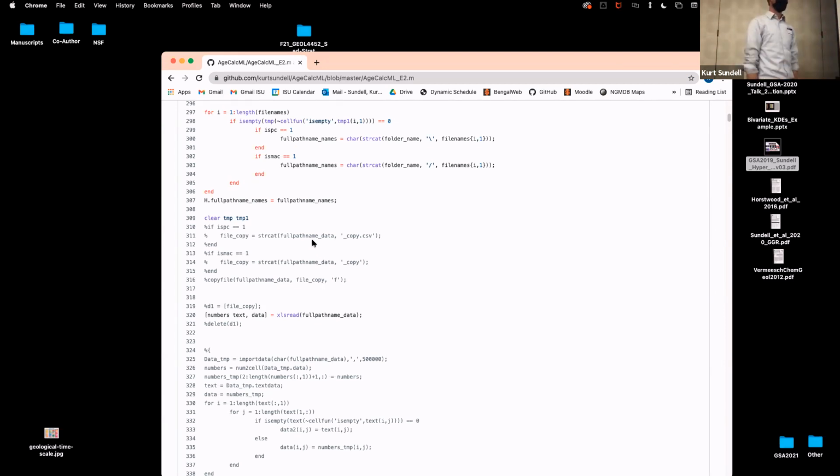We were chatting during the break, talking about robustness of ages. There's a lot of knobs you can turn, and Sarah went over some of the details. It's really kind of hard to tinker with the age too much, I've found. I've played a lot with data reduction and written a lot of code. Honestly, uranium-lead is a pretty robust system.